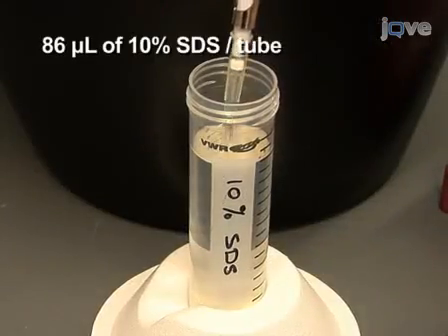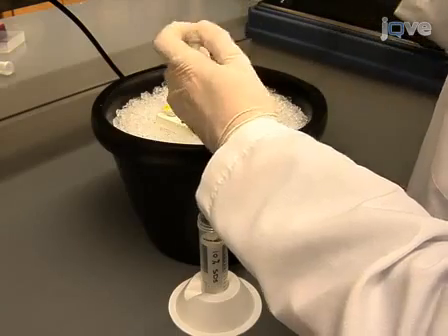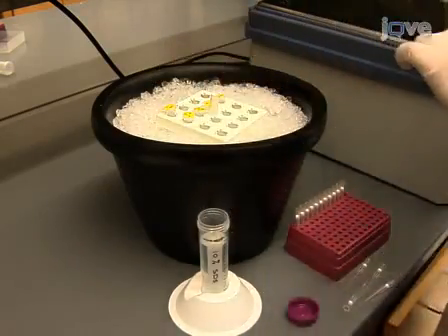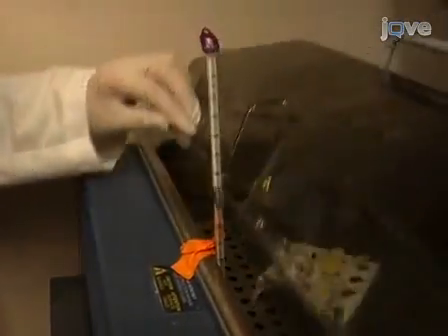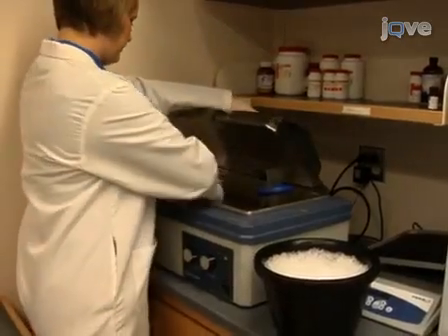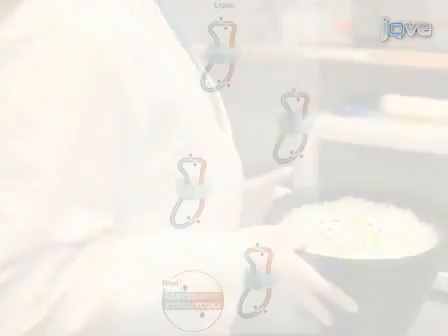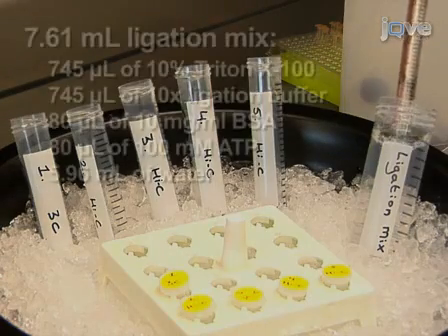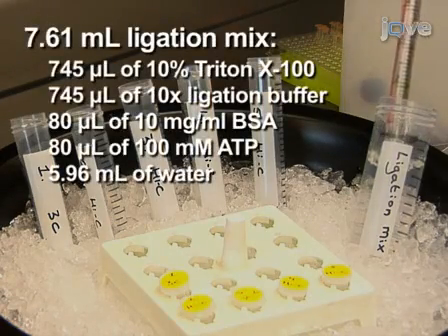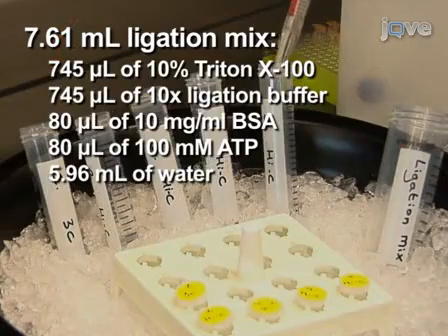Then, add 86 microliters of 10% SDS to all tubes to inactivate the enzymes. Incubate the tubes at 65 degrees Celsius for exactly 30 minutes and place them on ice immediately afterwards. To favour ligation events between cross-linked fragments, the ligation is performed under extremely dilute conditions. Working on ice, add 7.61 milliliters of ligation mix to each of 5 15 milliliter tubes.